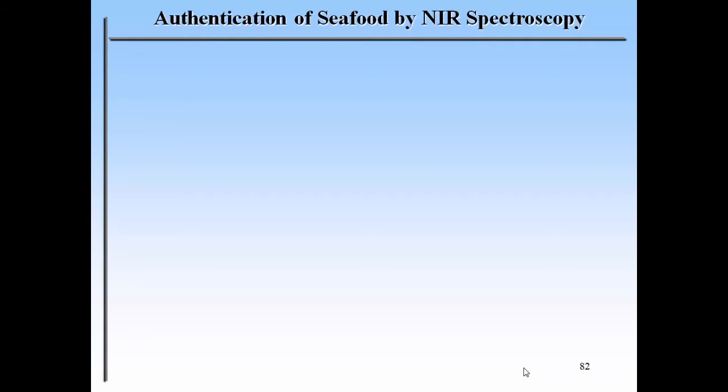And this is my favorite example. Authentication of seafood by near-infrared spectroscopy.